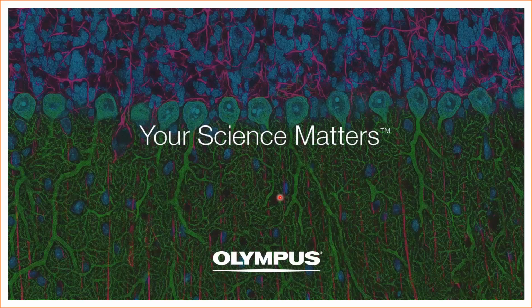The most important thing would be to make sure that the sample holder that you're using can actually support that. For example, in our system, the chamber that holds the sample media is made entirely of steel and glass. And the glass is held on the steel chamber with a silicone-based glue, so it doesn't melt even if you put in a very corrosive media. That being said, my understanding is that with the X-Clarity system, the media is not very corrosive, so it doesn't really need that much attention in that sense.